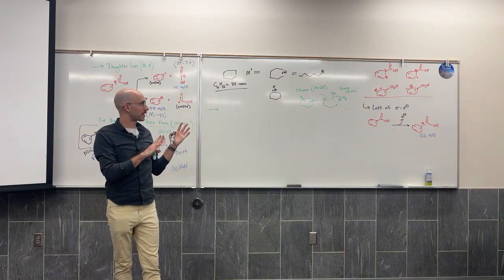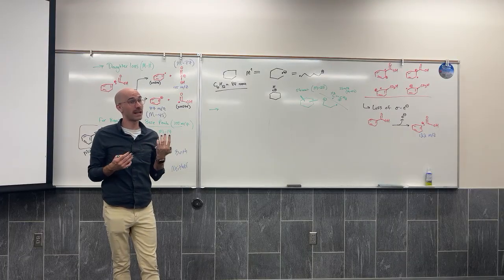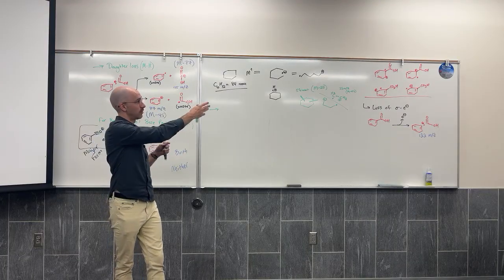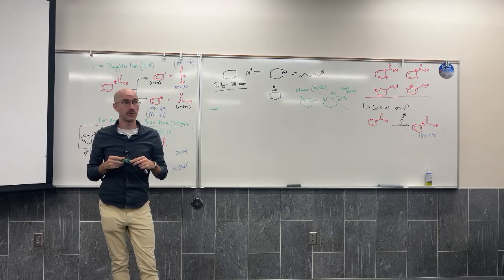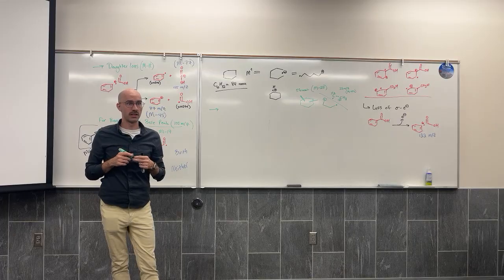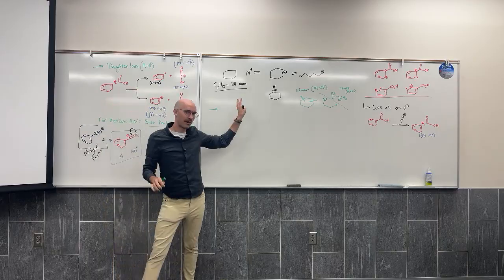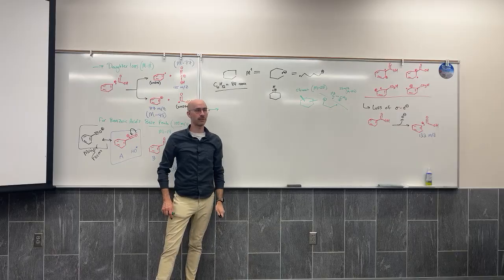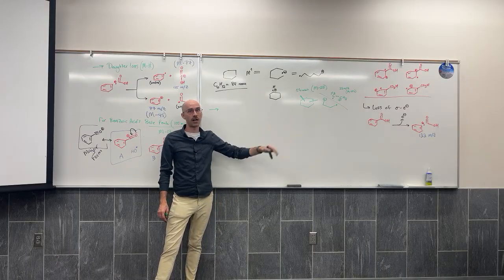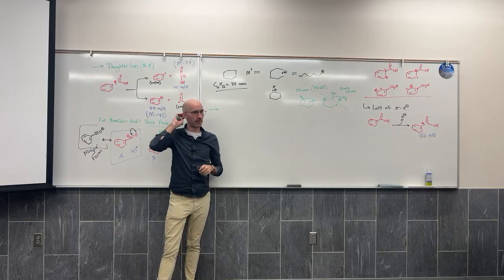What I'm trying to say here is that ring structures can go through some strange rearrangements and strange cleavage. So I'm not always going to ask you to be able to predict a base peak structure. I would only ask you to predict a base peak structure if it's obvious what has been lost and obvious how to get there. This is very challenging. When you take instrumentation as a class, or spectroscopy as an upper level class, you can talk more about this. Your problems will be a lot easier.